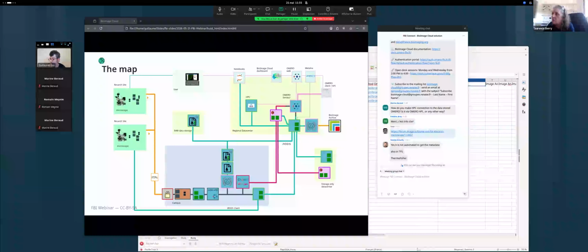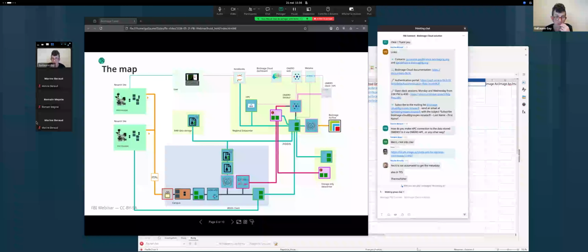So having the data accessible on the server is not a problem. But in the exported TIFF, there is absolutely no information about the acquisition parameters. It's not encoded, it's not there. That's bad. We have the microscope model, the pixel size, and the image size, and that's all for my part.